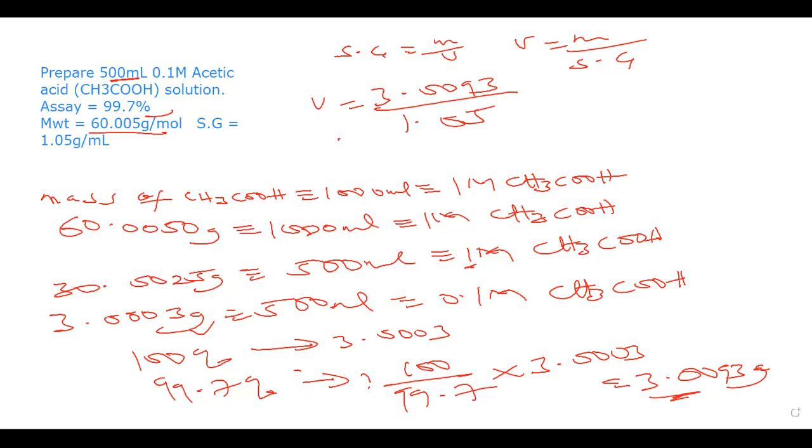So then I get the volume, left in 2 decimal places, 2.87 mils.